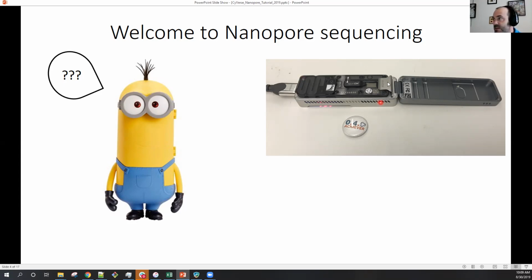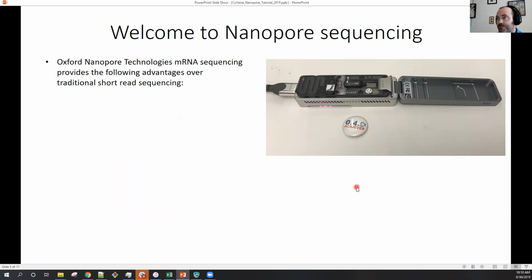And this flow cell right here, where you would actually load your sequencing library, contains, just in this little region here, hundreds of thousands of pores that are going to be actively sequencing your sample. So it's an amazing technology, and I'm not going to belabor it too much, otherwise I'll sound like a fanboy. But I would just remind you to go to Oxford Nanopore's website, look at their demos, and check one out for yourself, because it's extremely cheap. The cost of entry is really low.